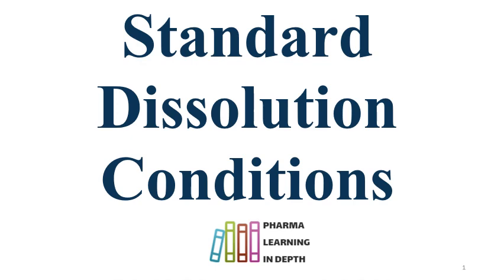These conditions are given by regulatory agencies like US FDA, and the same are also followed for IR formulations containing highly soluble drug substances by other regulatory authorities as well. What will happen if we don't use these conditions and the acceptance criteria? So let's start with the video.